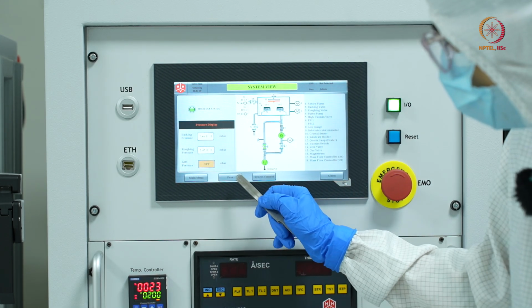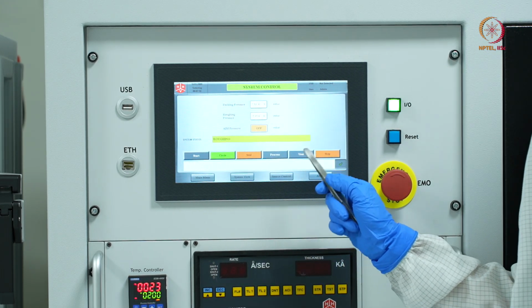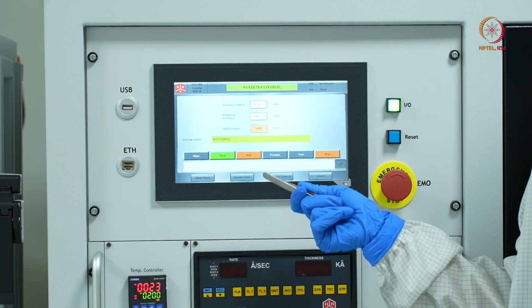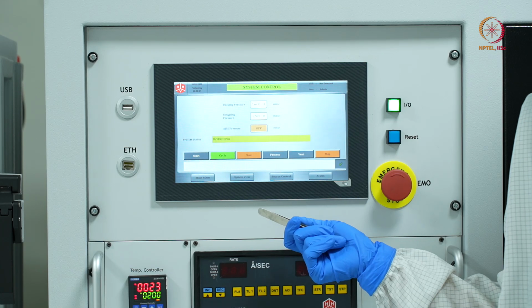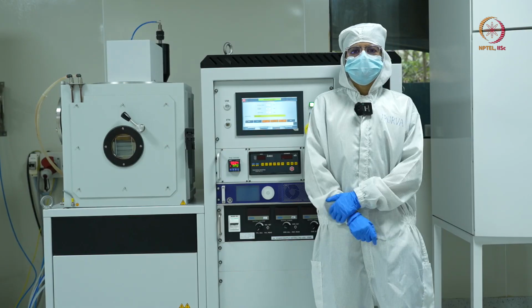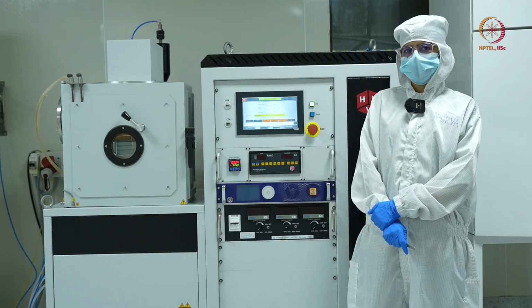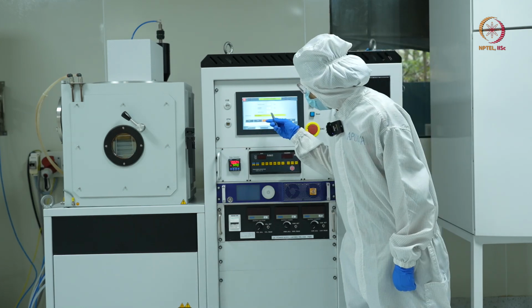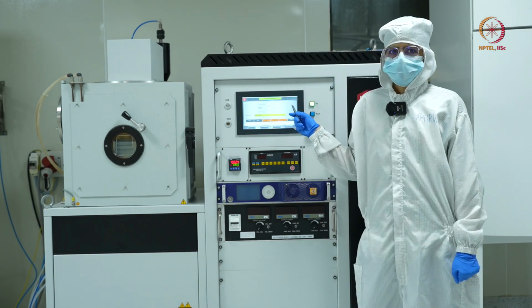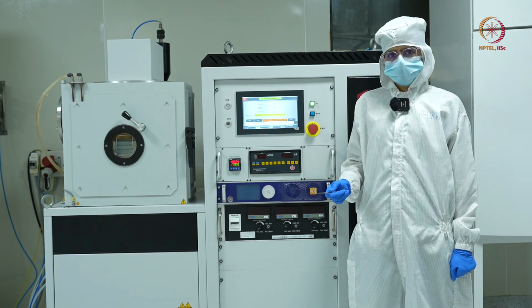Now we'll go back to system control, and we'll wait for 1.5 hours for our vacuum to reach the desired level, and we'll resume our deposition process once it has. So after waiting for 1.5 hours, we have reached the desired vacuum level. As you can see, it is 3.2 e raised to power minus 6 millibar. So this is our desired vacuum level. Now we can start our deposition.